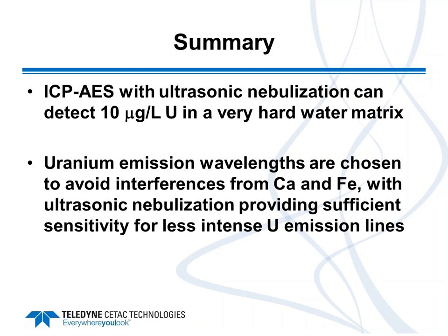In general, we recommend between 0.1 and 0.5% total dissolved solids. Above that, of course, you can overload the ICP, and in the case of ICP emission, you can suffer very large signal suppression. And in the case of ICPMS, you can have salting of the interface cones.